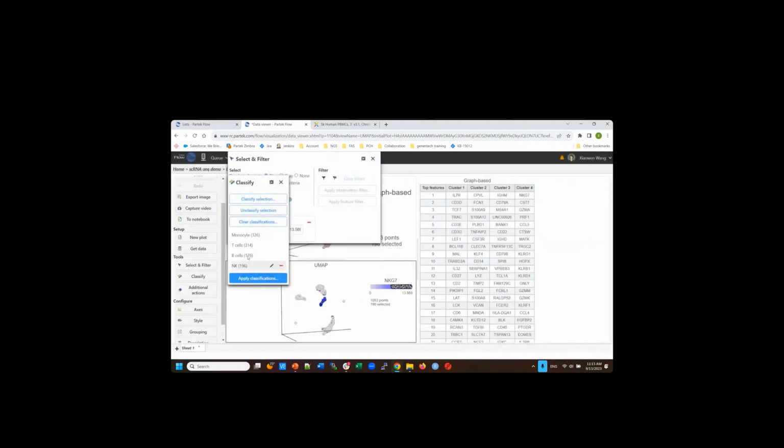Okay, T cell got changed. So NK cells 196. And now I want to use GNLY. Those 196 definitely have high expression of NKG7. Now I want to remove this criteria and use GNLY greater than, again, 7. So I have 106.